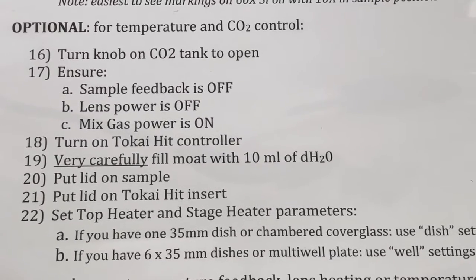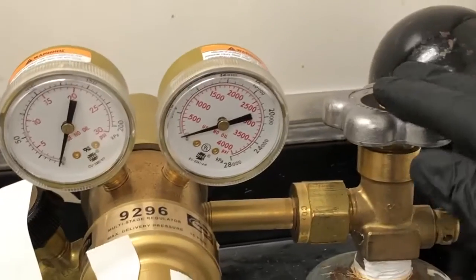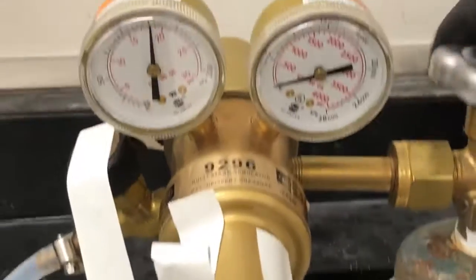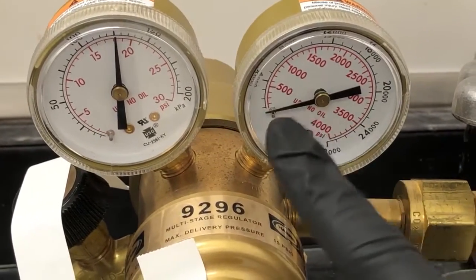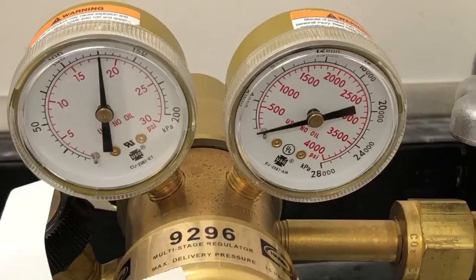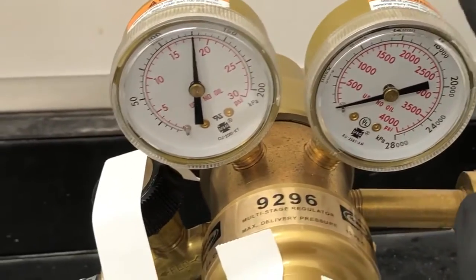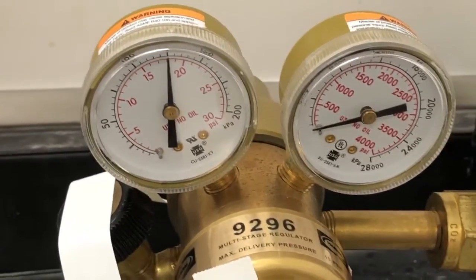First, if we are doing that, we need to turn the knob on the CO2 tank to open. The CO2 tank is in this corner. This is the knob — you can turn it to open. Don't worry if this is not immediately going up to something like 500 or a few hundred PSI. It takes time for this needle to go up. As long as this one jumped up, you're fine.